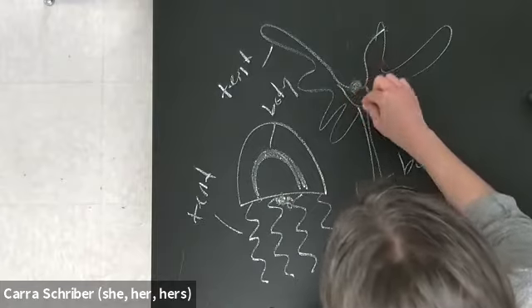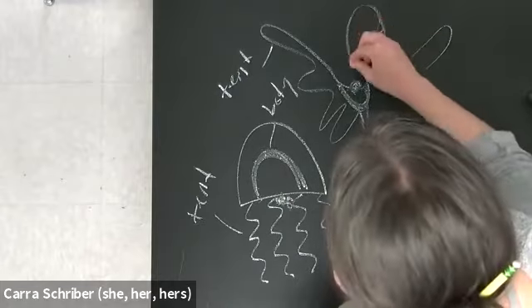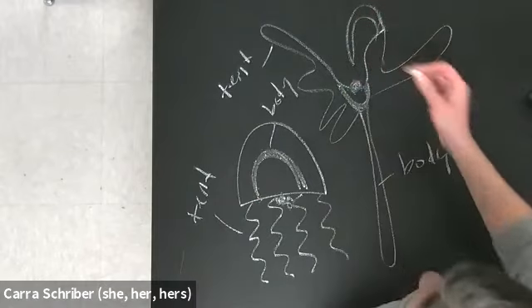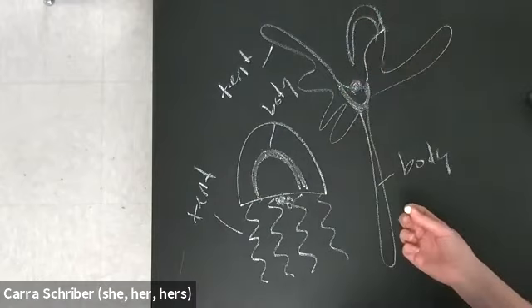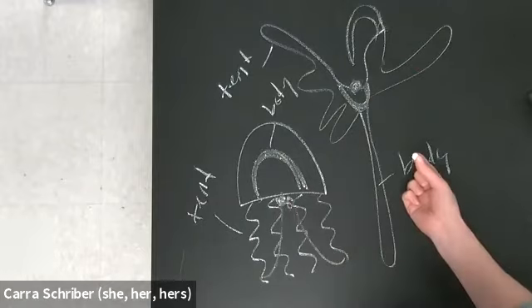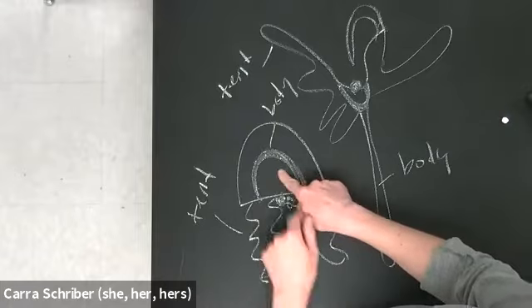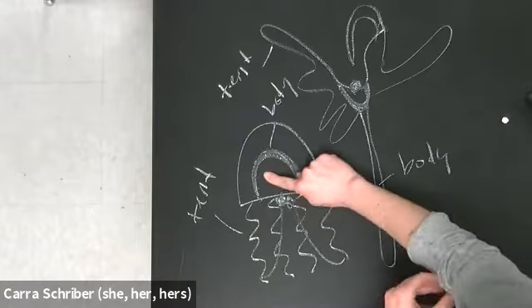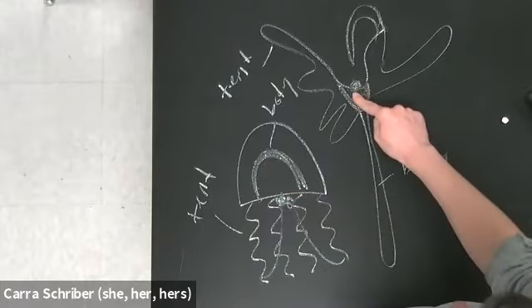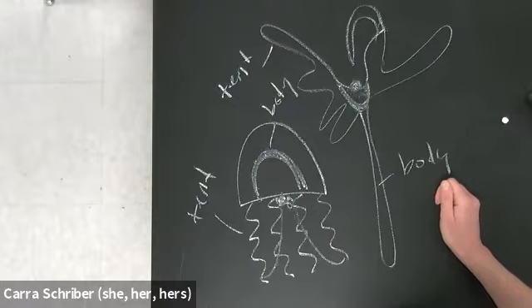And then digestive system, incomplete digestive system is right in here. So these tentacles are going to feed the mouth, any particles or anything that it catches. And in this case, these tentacles can feed stuff into the mouth here. And what we find is that in both of these forms, when they ingest something, it goes here into the gastrovascular cavity, and it's digested, the nutrients are absorbed, and then guess where it goes?